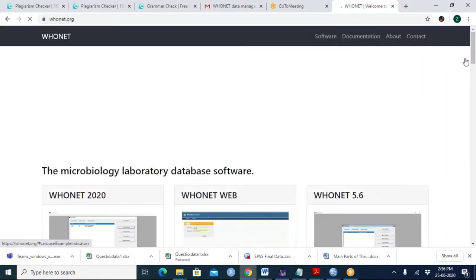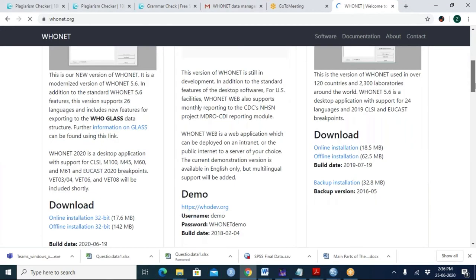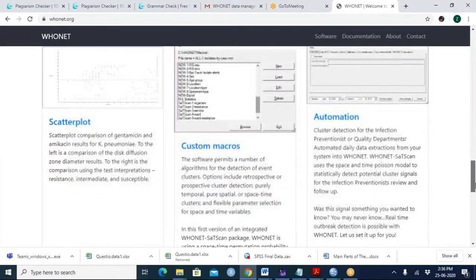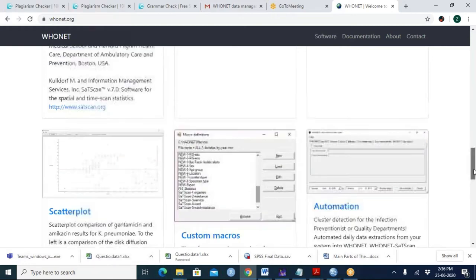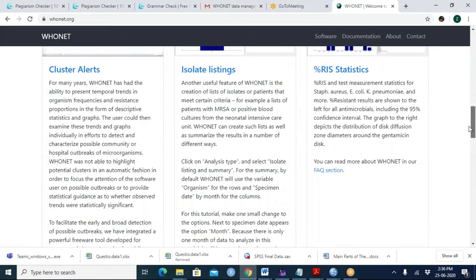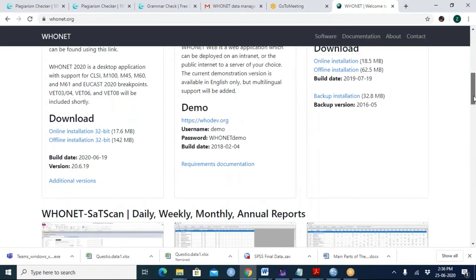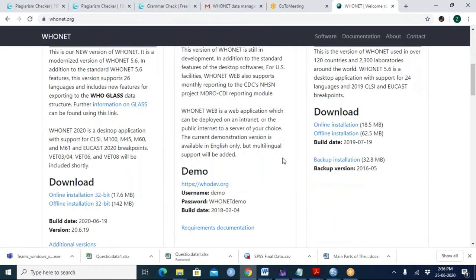Go down a little bit. Down a little more. Okay, stop right there. You see the online installer? No, too far. Go back towards the top. We simply want to update the software. Further up. Stop. You see it says download? Yes, okay. You see it?